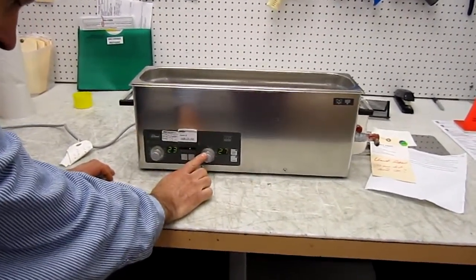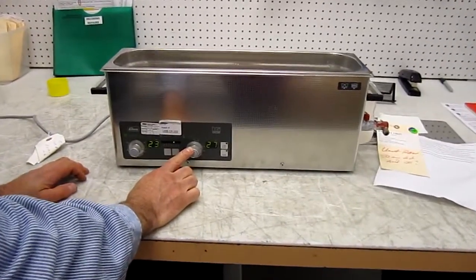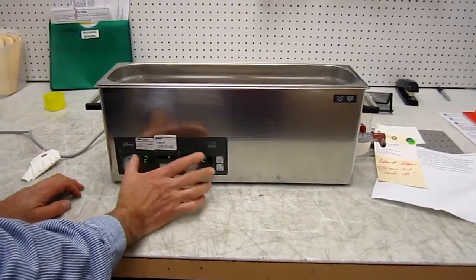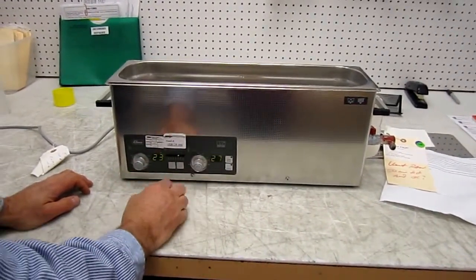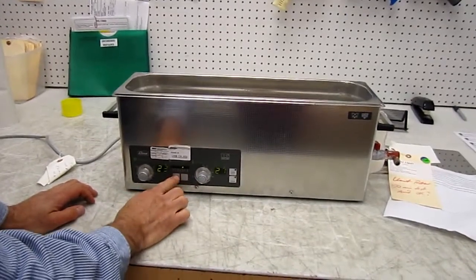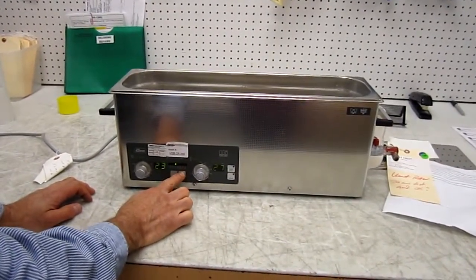You can set the timer and the intensity of this unit from the keyboard, including the temperature from these two knobs. The displays now operate. You can see the times change and the intensities will change by going up and down here.